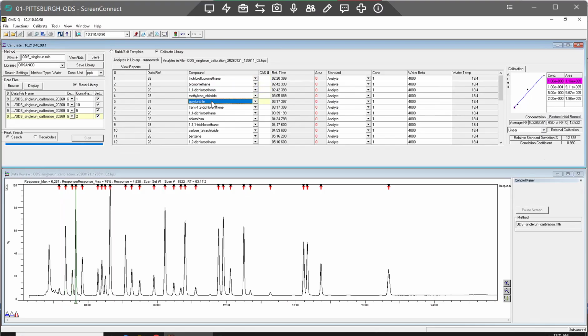Now I can't even remember on this software if you don't have a good R squared, if there's much you can really do with it, but we'll see when we get there. And then your standard deviation should just be below 20%. So all of these are under 10, or maybe a little more, but so 0.99, 0.997, 0.998, 0.984. Okay, well, let me see if there's instructions on what to do for that.